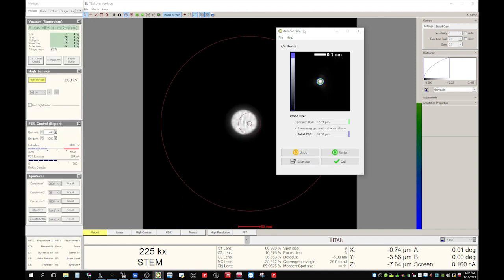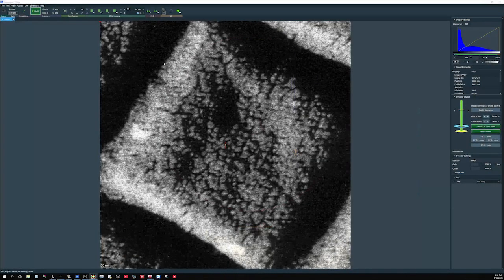Now it says it's completed, and it shows this total D50, which is the estimated probe size — 58 picometers. That's pretty good. The best way to check if it's good or not is just take an image.